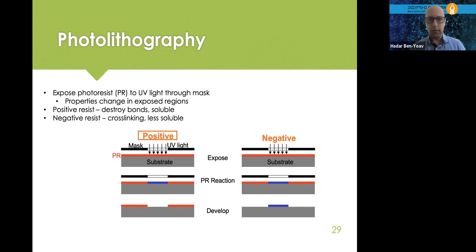And now we put it in another solution that removes the photoresist that was not removed before, so this area will be removed together with the gold.